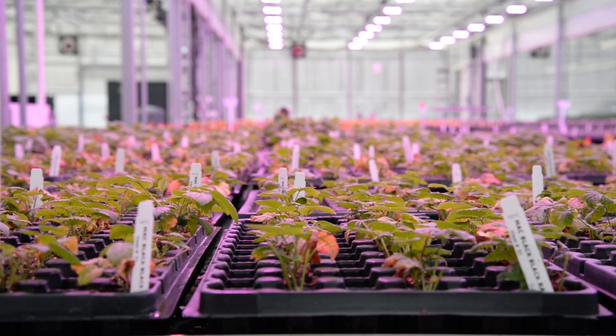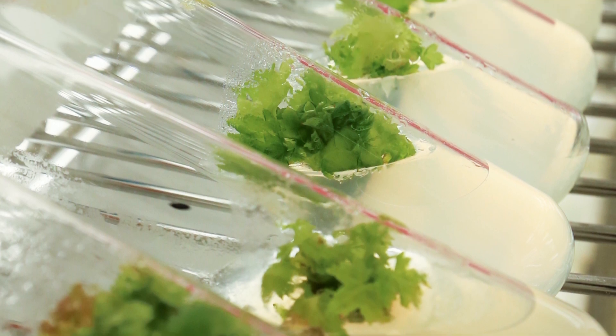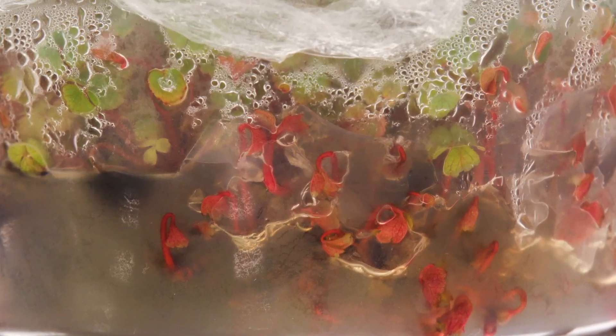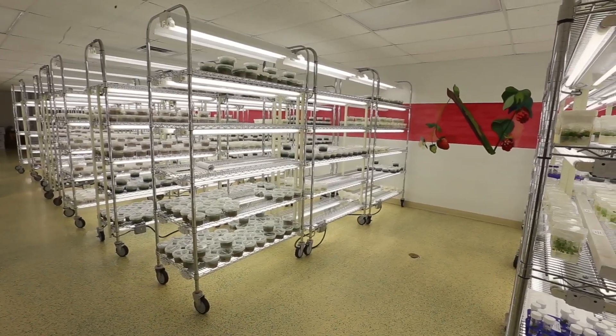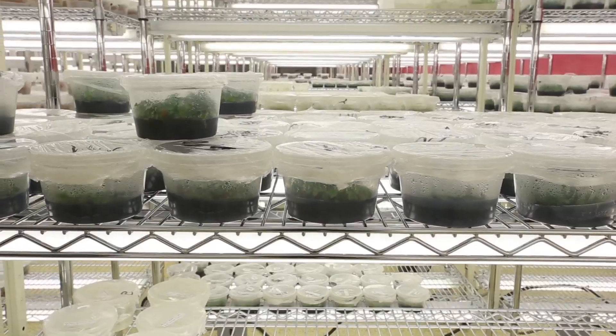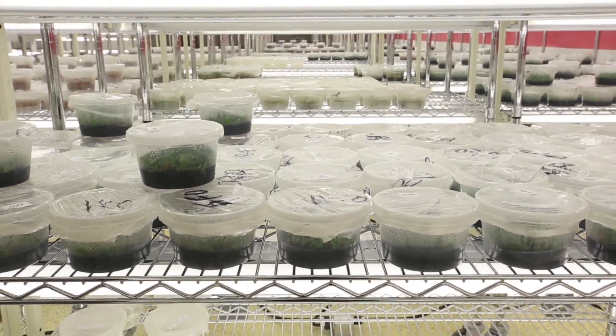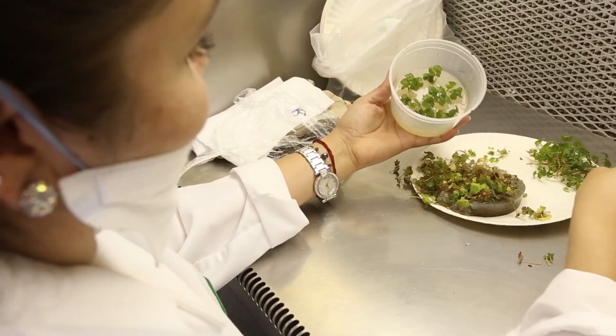With strawberries, it's taking the meristemic tissue out of the runner tip. You take it out and then you put it on growing medium inside of a jar, where that little tissue will then grow into a plant. They're kept in the growth room of the lab — there's no soil. It's all a liquid or a gel, and in that liquid is all the growing requirements: nutrients, hormones, growth regulators that you need to grow plants.